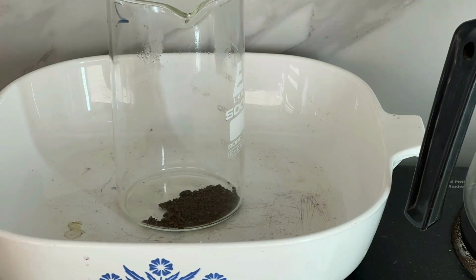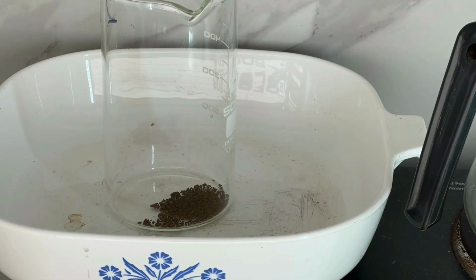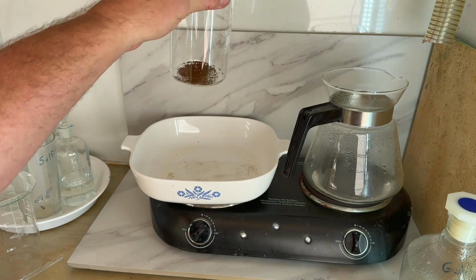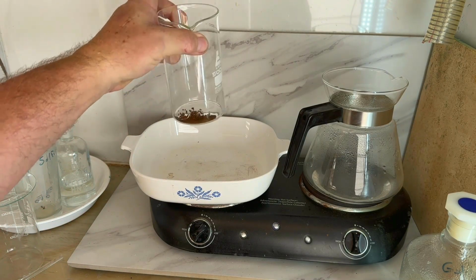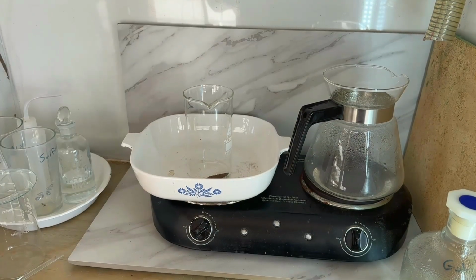So we're drying our powder on a warm catch plate. The heat's not on, that's just residual warmth. We don't want anything too hot, we don't want it splattering everywhere. So our gold powder is dry. See, it's moving around there. We're going to go ahead and weigh this up, see what we got.